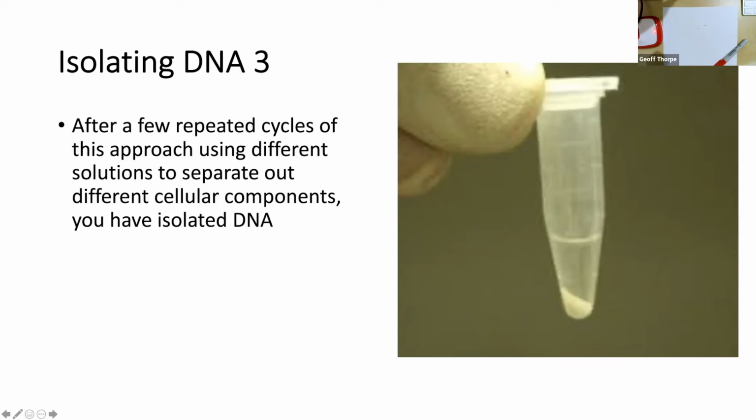And you would then discard that liquid. You would add in a special buffer where DNA is just nice and stable and happy, and you can then store that DNA in solution in the freezer and pull it out whenever you want. So that's what you'll get at the end.